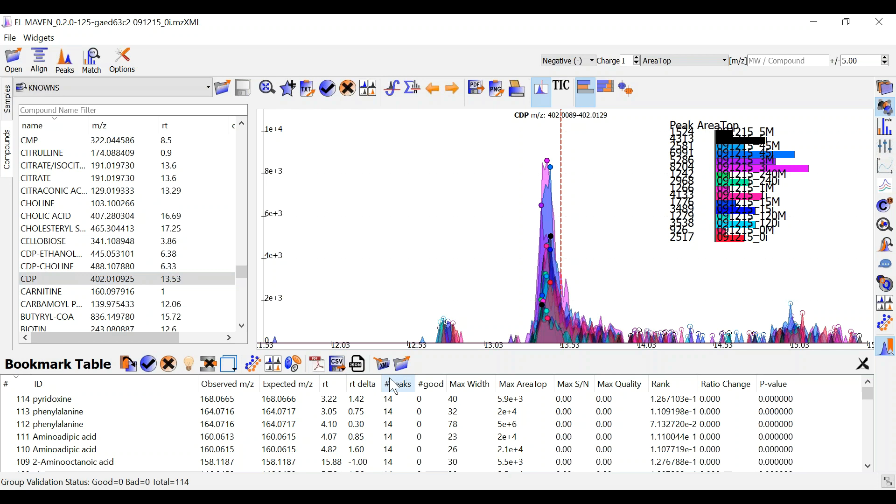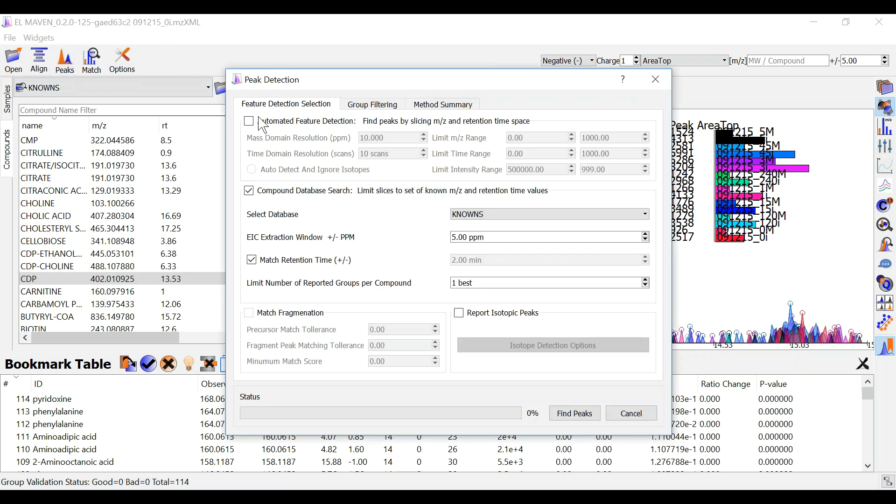The other way to curate your peaks is called automatic curation. For this you can go to the peaks widget over here and select one of these two settings.